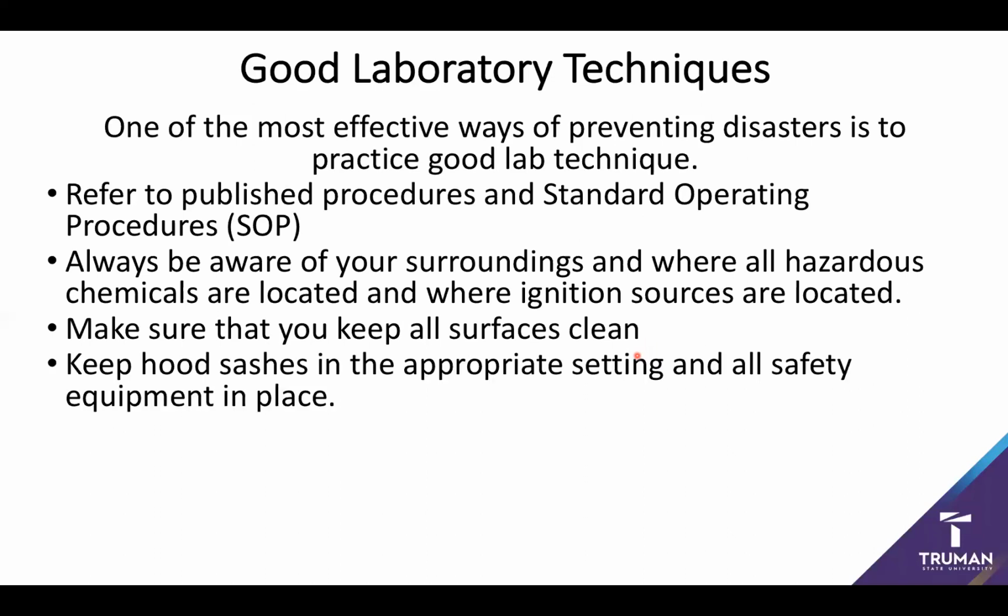And again, one of the big things that I've noticed is often a problem is if you're working in the hood, make sure that you keep the hood sashes at the appropriate setting. So essentially, do not move the hood sash too high. Otherwise, it doesn't act as a safety hood. There's insufficient ventilation or airflow inside the hood, and you don't have a glass protector sitting in place in case something explodes or spills.